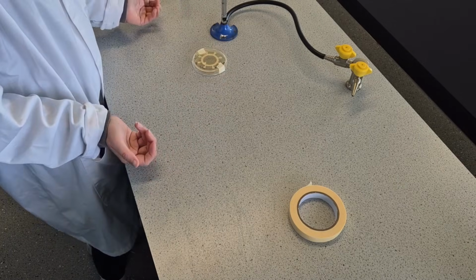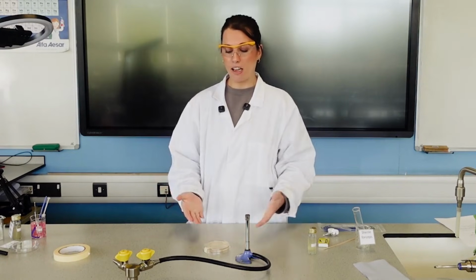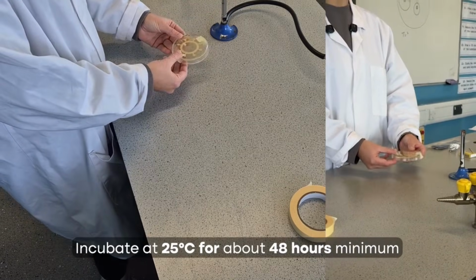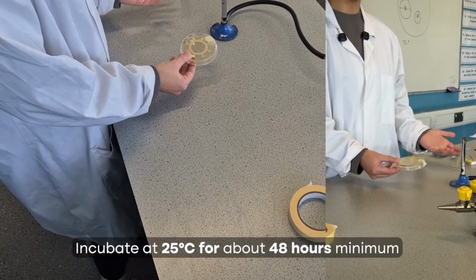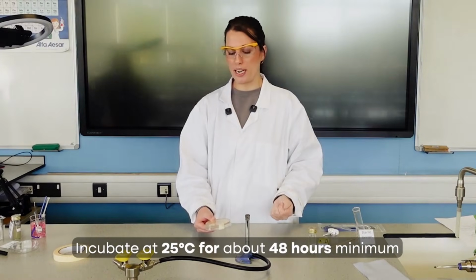Okay, so we've left it long enough. It is now all staying on the top. The dish has stayed there as well. And that is our plate ready made to now go to be incubated at 25 degrees C for about 48 hours minimum and about 1 week maximum. Otherwise you'll have too much growth and it could be potentially harmful.